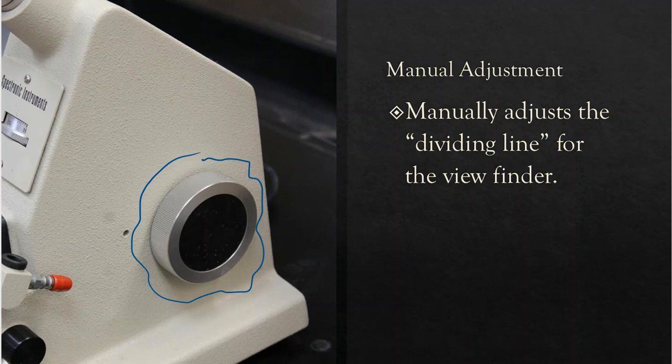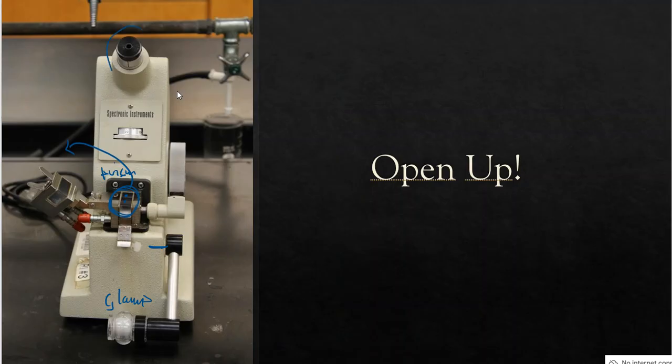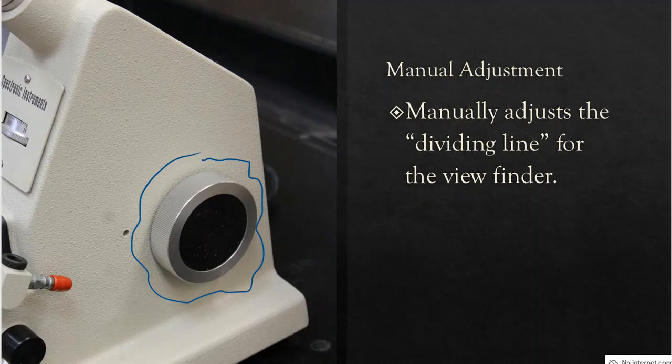When you put a sample on the refractometer and you look through the eyepiece, which is right up here at the top, you can see that. It looks like a microscope, right? When you do this, you're going to look through the eyepiece, and there is a chance that you will see a dark half and a lighter half.